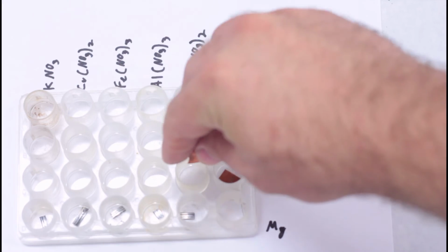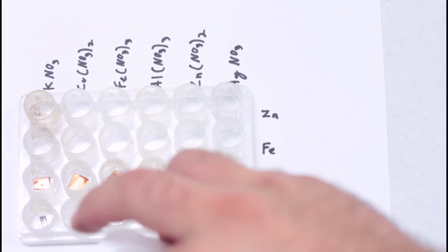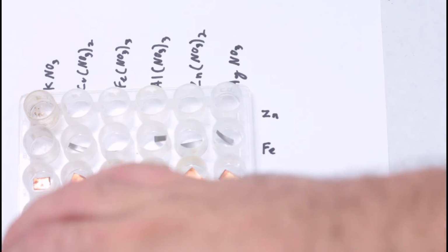Next, grab at least 6 pieces of each metal in weighboats. Just grab a bunch at once because you can always return your excess. No need to waste time making sure you grab exactly 6.